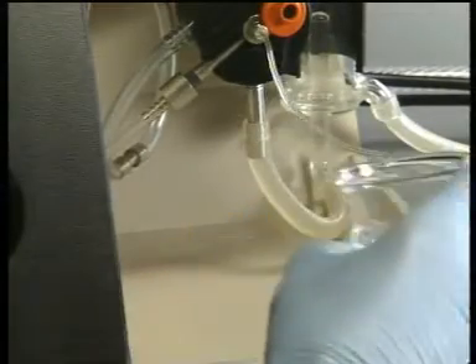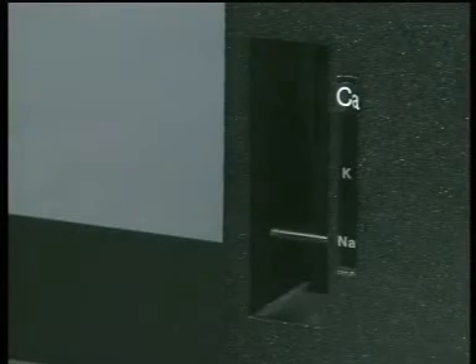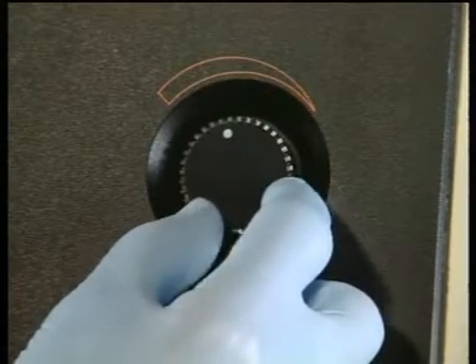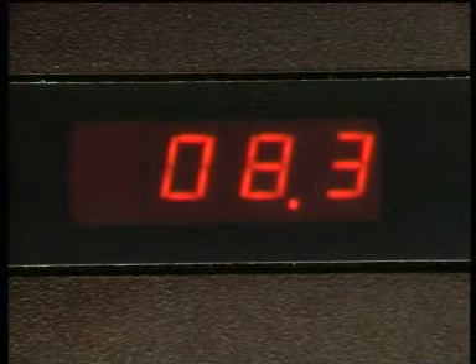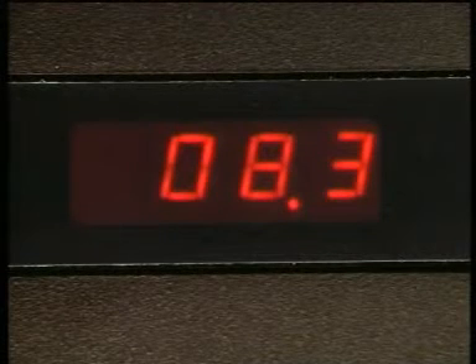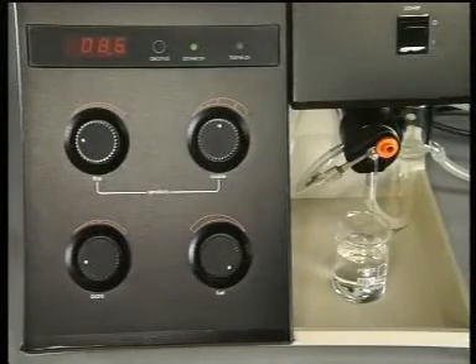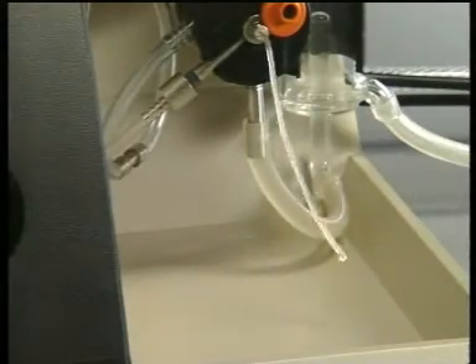Then replace the blank solution with a dilute solution of the element to be measured — in this case, sodium. Check that the correct filter is in place. Then reduce the flow of fuel until the meter reading is at a maximum. Now aspirate the blank solution again to remove any traces of sodium from the nebulizer.